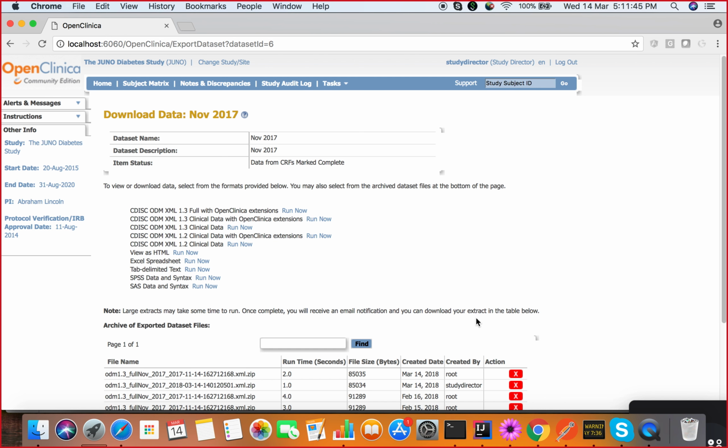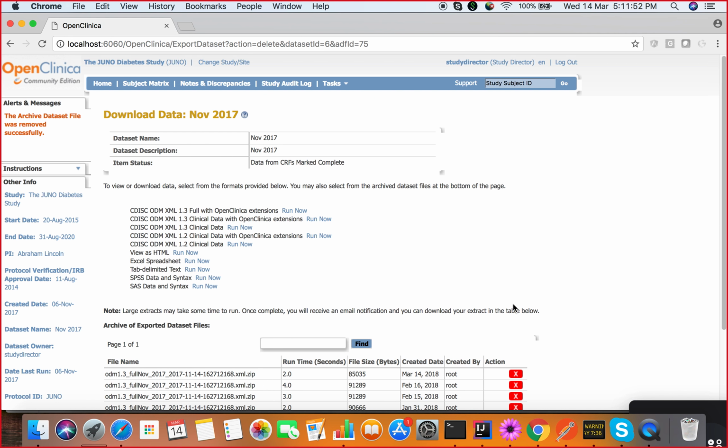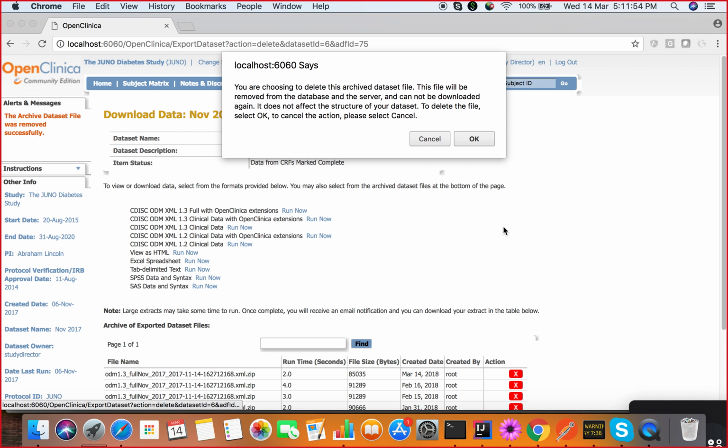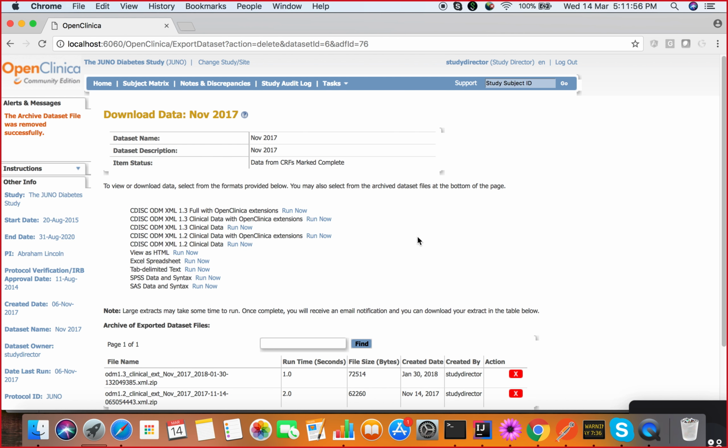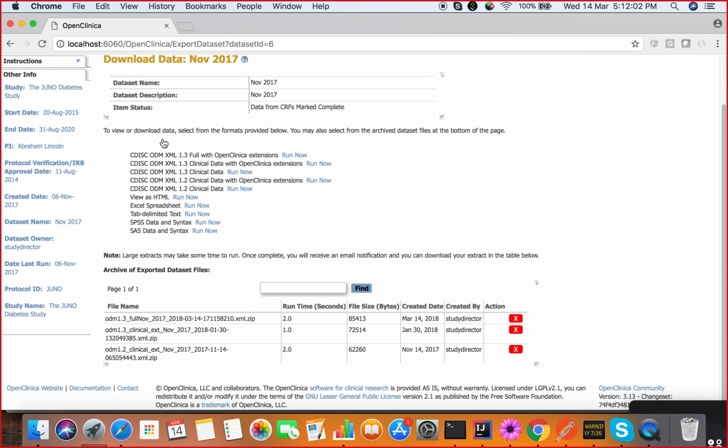I'm not sure which one is what, so let me delete all the data sets that were created today so that I know exactly it is using the latest data set. So I will run this once more. Go back to the data set. Okay, this one got just now created, March 14. So I will download this data set.